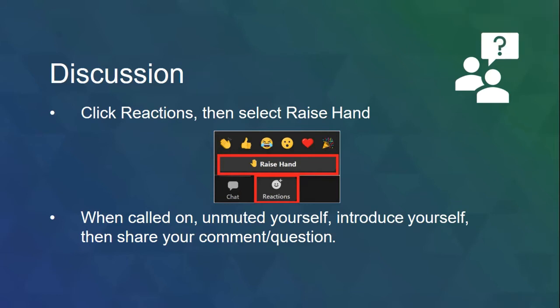Can you hear me? Sorry. Yes. Okay, so what do you use for fixation of the EBUS TBNA specimen? Like you showed in the picture, it's a pretty big specimen, like the clot. Yeah, so great question.